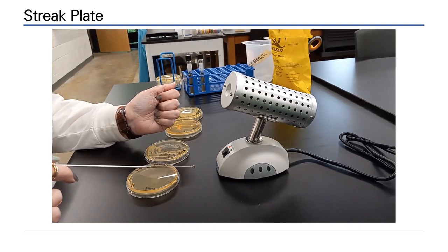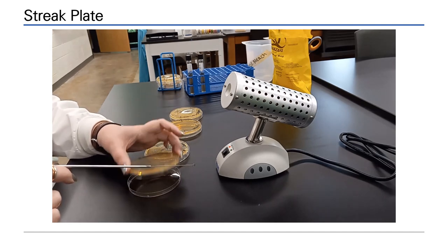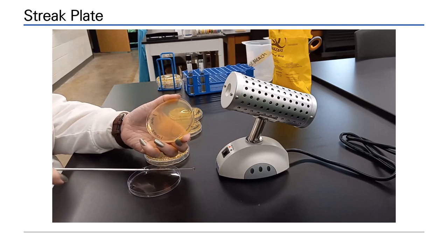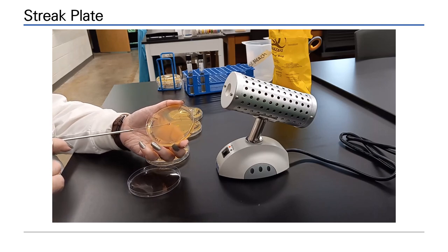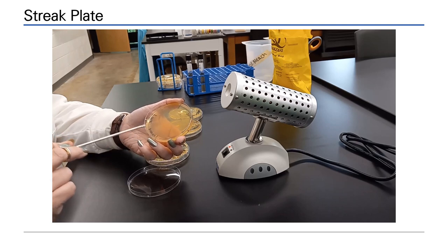Sterilize the loop again. Make sure it cools. Rock the plate so that you can see where your quadrant streak ended, and streak into the next section.